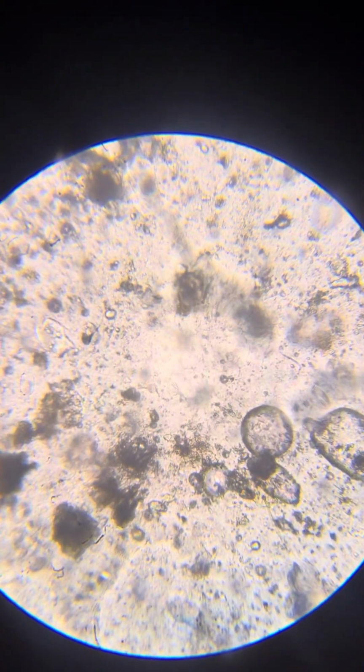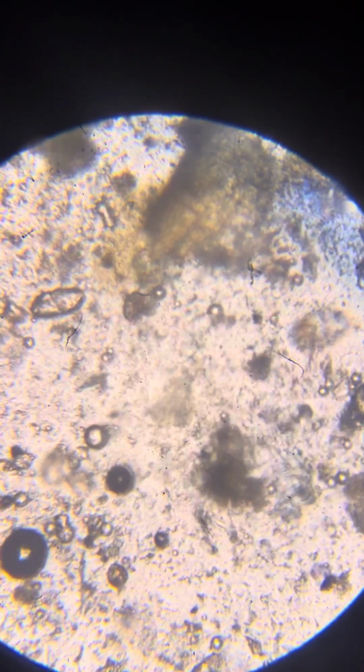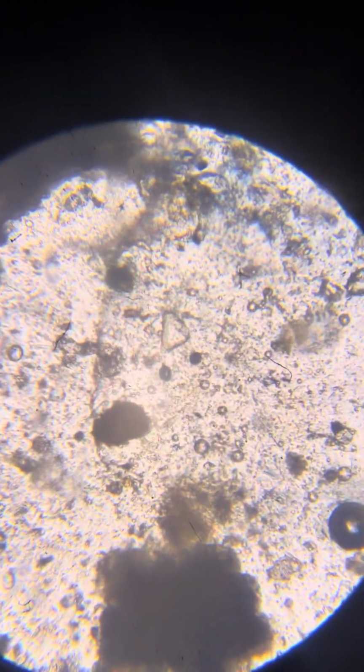Nice neurons. So this is 150. Maybe we want to get an even better magnification. We'll try to find a nice place. Oops. Yeah, so it's kind of squeaking. Maybe we'll take a magnification here. We'll try to zoom in even more. Hopefully we'll be able to see something.